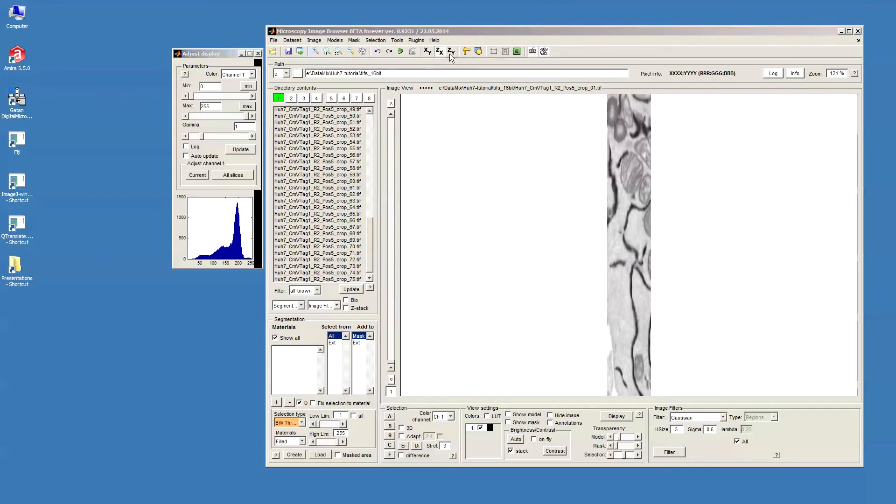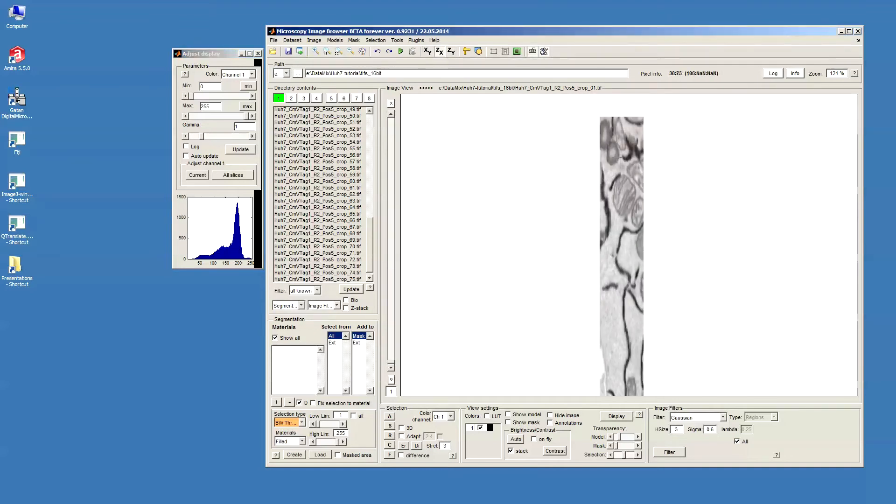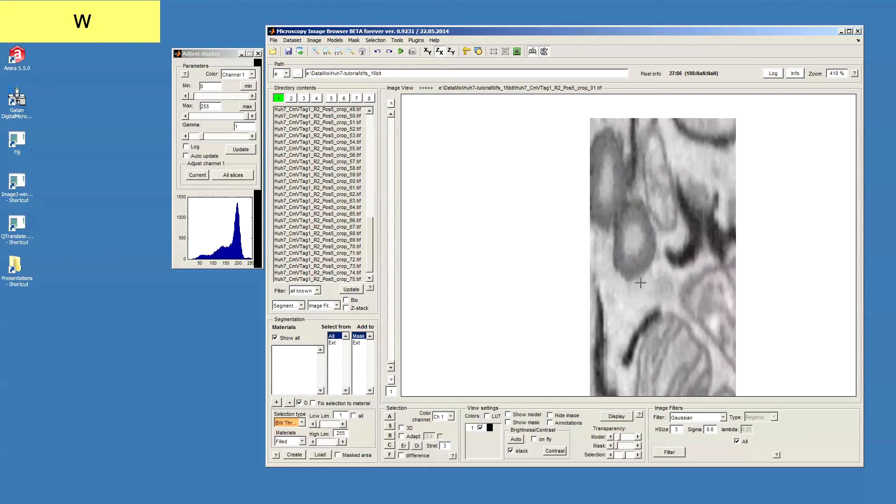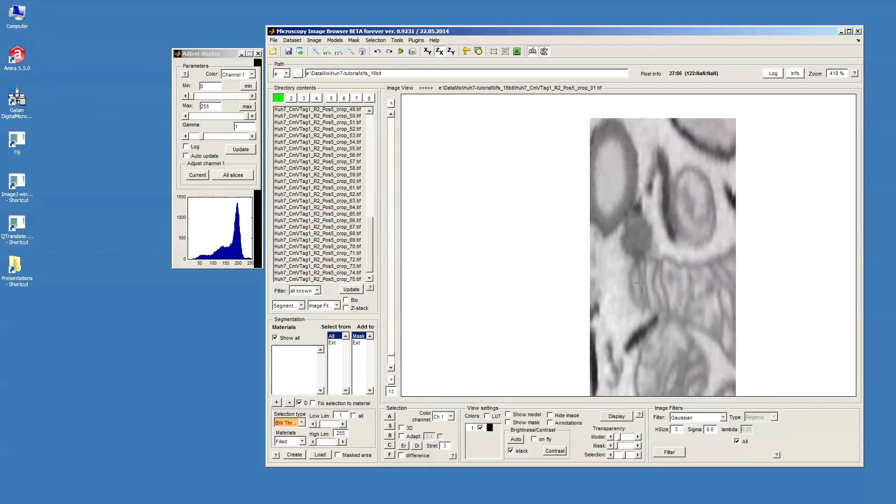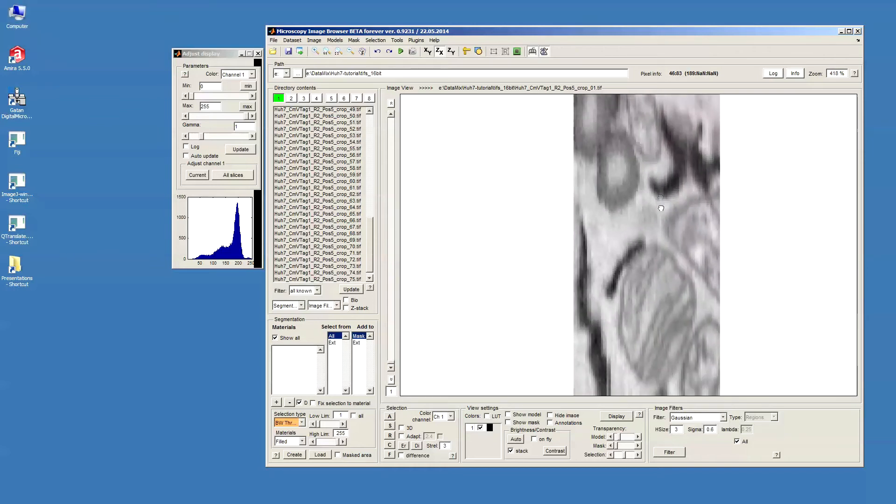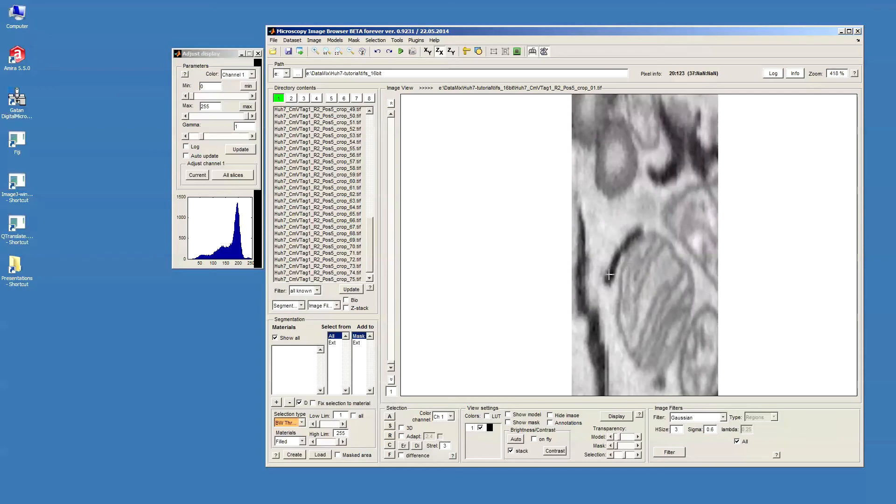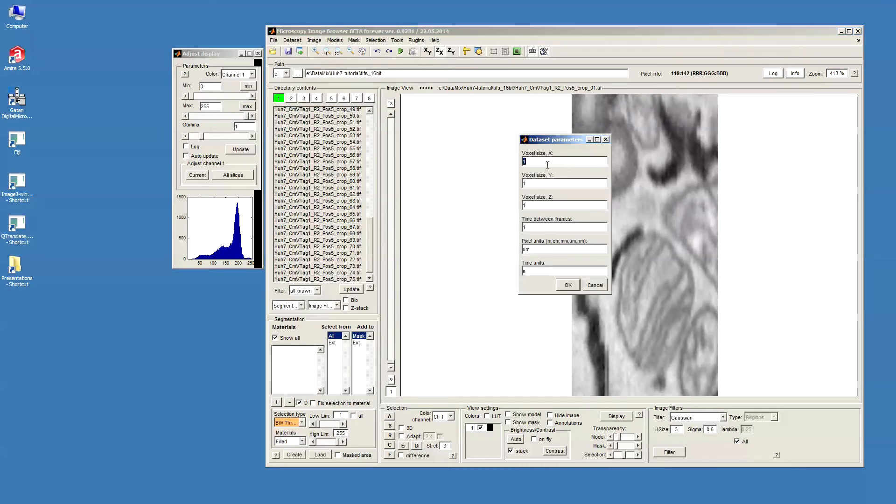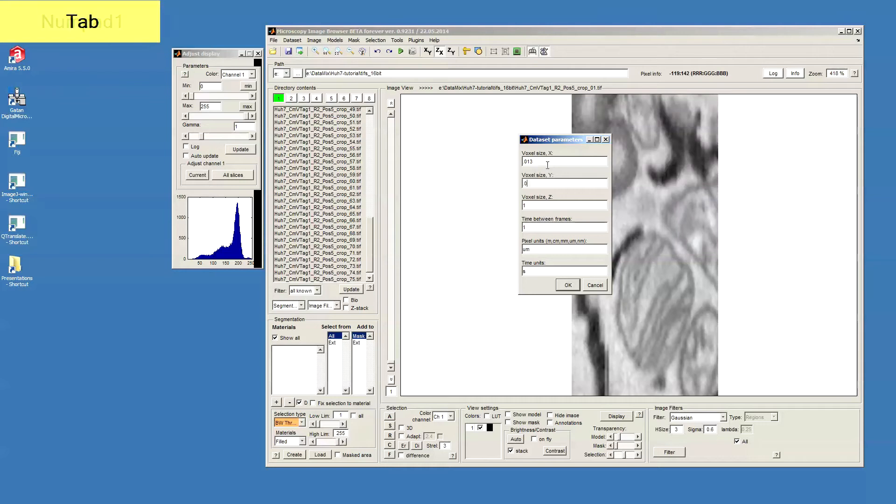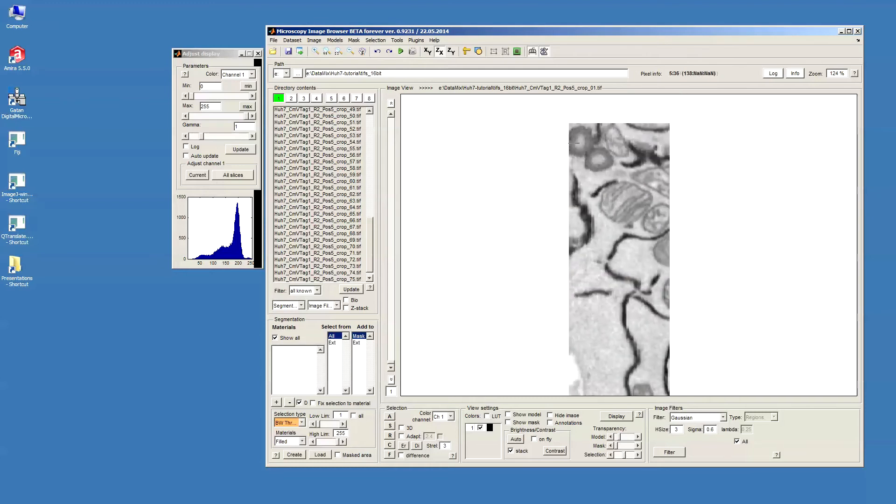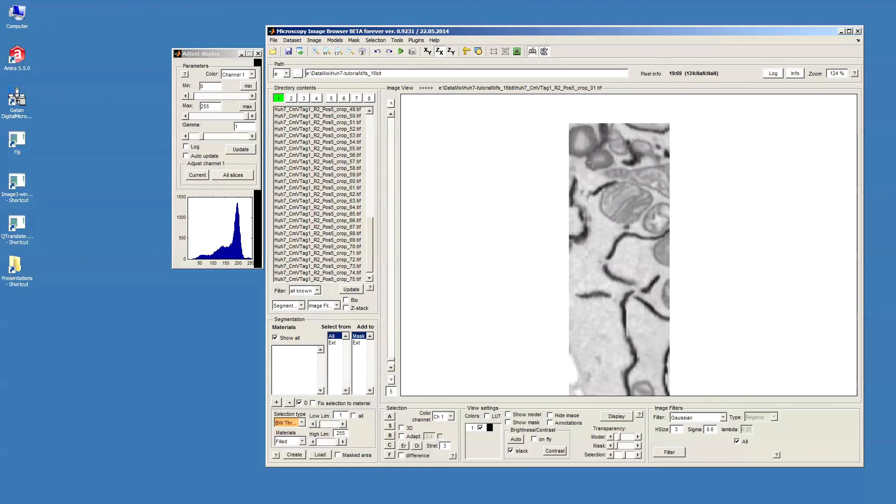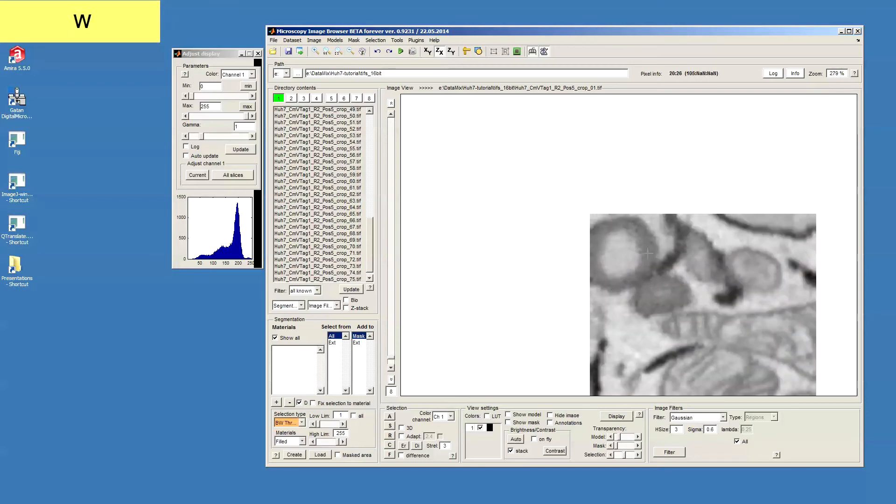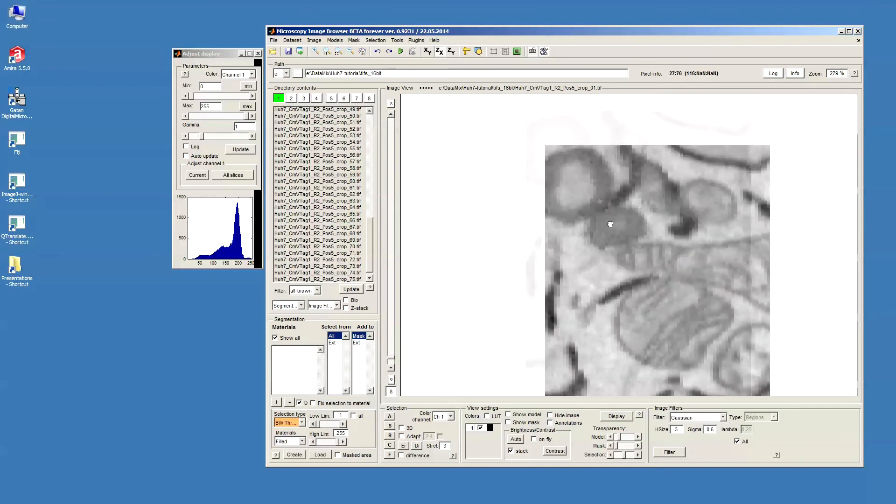We can check the data in different projections, but actually you can see here the data looks a little bit squeezed. This is because the actual voxels in this dataset are not isotropic. In order to fix this, we should go to the dataset parameters and define the proper voxel size. In this particular case I have 13 nm xy and 30 nm z resolution. After that you can see the data was stretched properly and these lipid droplets look quite roundish as they should be.